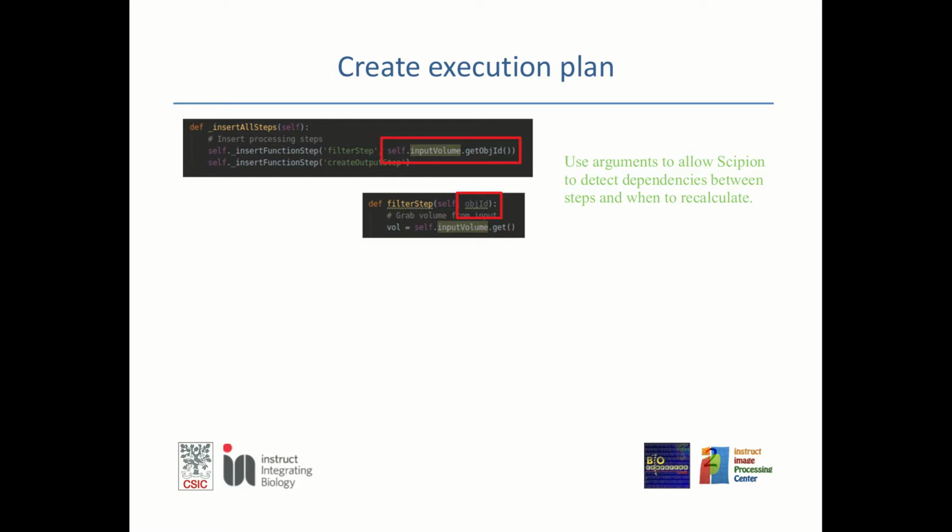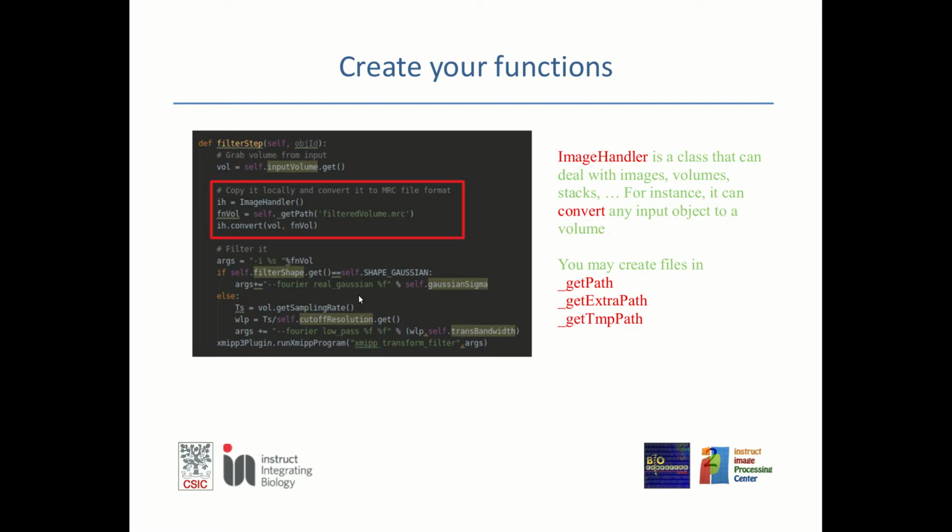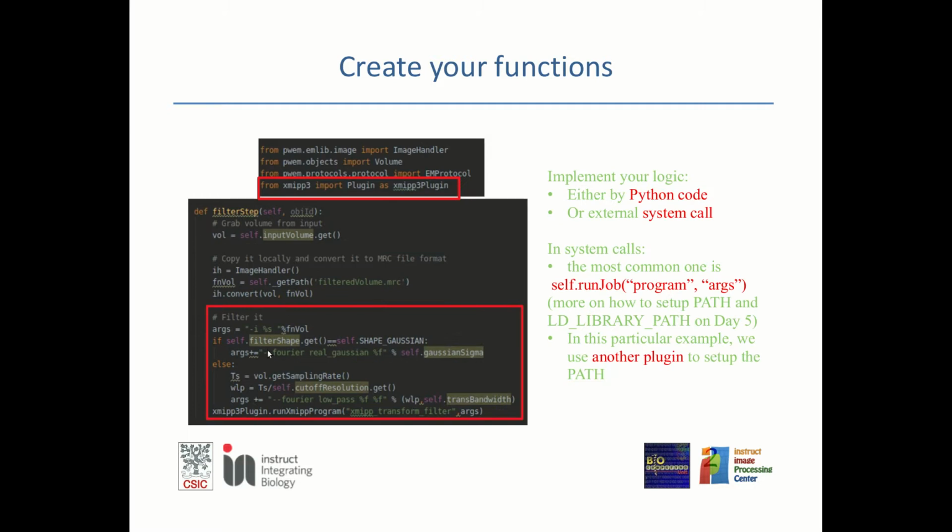They only exist when the graph is executed. So when it is executed, all these steps are executed at this point.